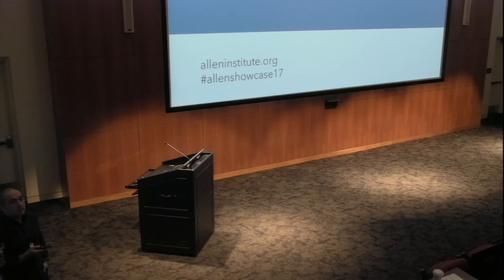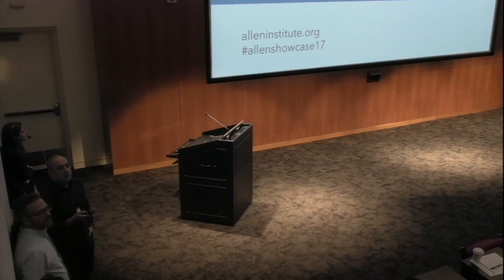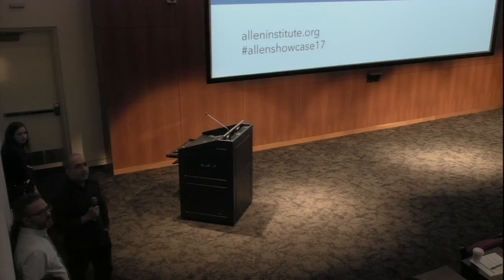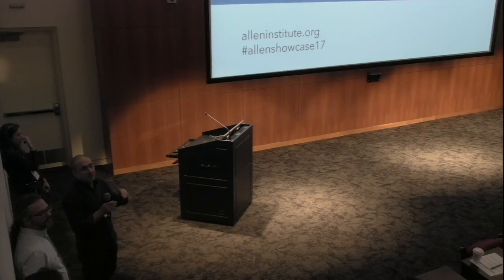So there are quite a few places, for example, the mossy fiber granule cell synapse in the cerebellar cortex, where the structure of the glia seems to be very informative and important. Are you reconstructing glia around all of these synapses? The glia is completely reconstructed. Our focus is really on the neuron part, but hopefully the data will be shared and available to people that are interested in glial aspects, astrocytes, and so forth.